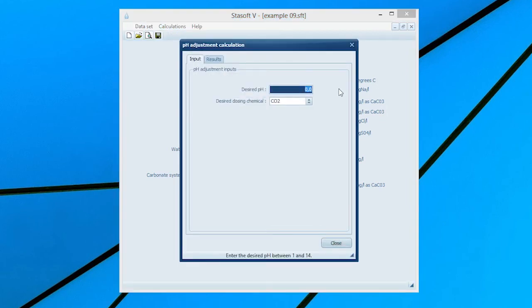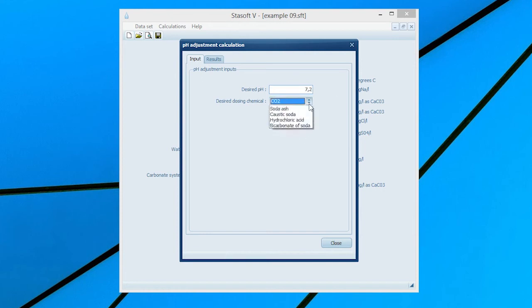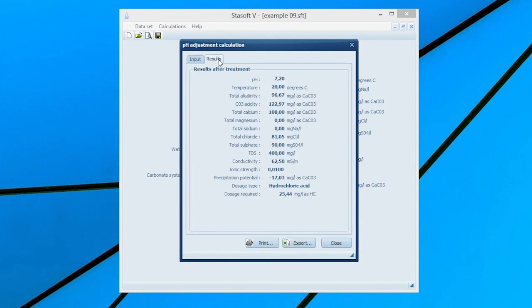Enter the specified pH of 7.2 into the desired pH input box and select the Hydrochloric Acid Dosage option. Selection of the Results menu option will bring the Results After Treatment window onto the screen with values for the final state of water and dosage of hydrochloric acid required to adjust the water to the prescribed pH.